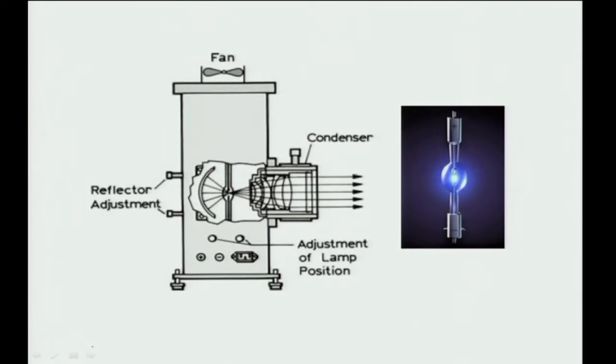And this is how a xenon lamp typically looks. Now, this is a personal request from my side: do not take the cover off and look at a xenon lamp, because that might be the last time that you look at anything, right. Depending on the wattage, these are very high luminosity, very high intensities. Even before you realize, it will damage your eyes. You would never want to do that, right.